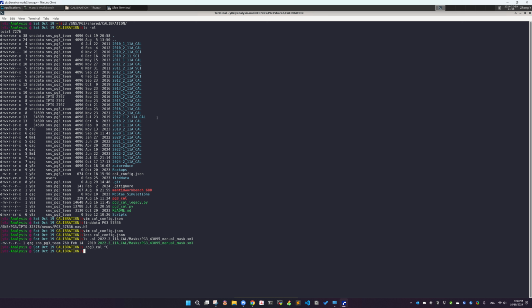In practice, we do have the automatic way to do that. Actually, we don't need to do anything if things are working normally. What I mean is that once the diamond data is collected, once the data file, the Nexus file, is ready, the auto reduction engine has already been configured in such a way that it will automatically kick off the auto reduction.